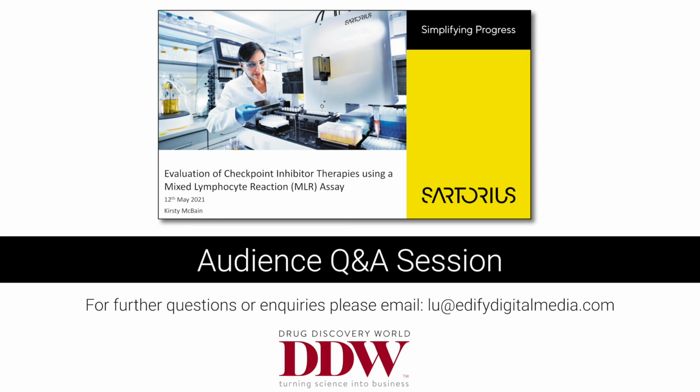Another question: how does this assay compare to traditional MLR assays? One of the main differences with this assay compared to the more traditional techniques is that you're looking at all the parameters in a single well. Traditionally, you'd need to use, for example, a separate assay for marker expression, such as traditional flow, and then also proliferation, and then probably cytokine release, for which you'd use a separate ELISA.